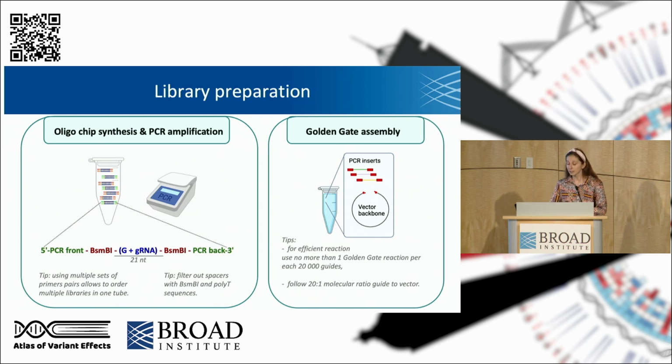The guide RNA sequence would be flanked by the restriction sites and also by the PCR primers for the PCR amplification.